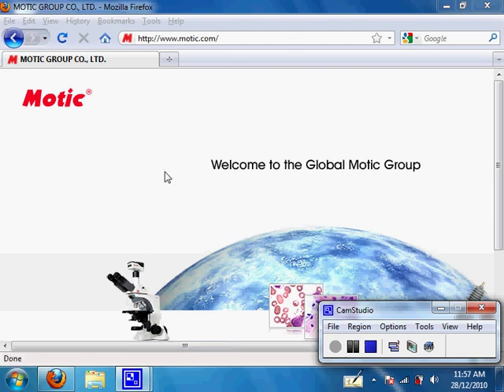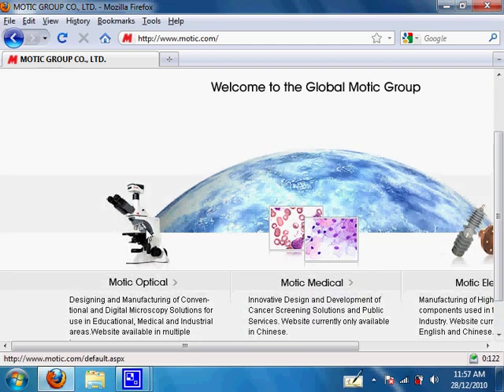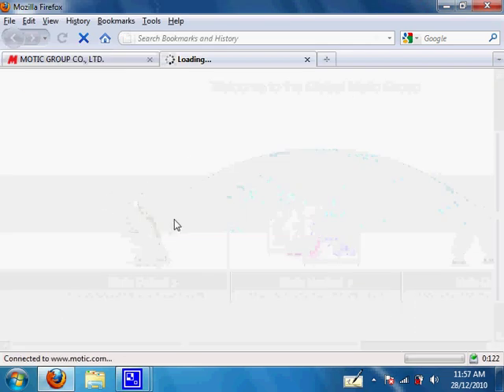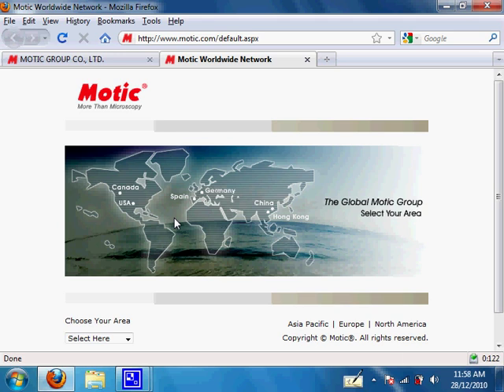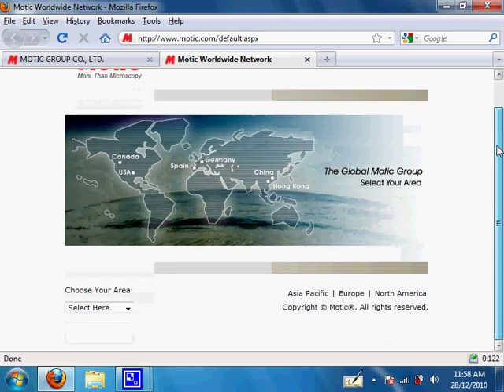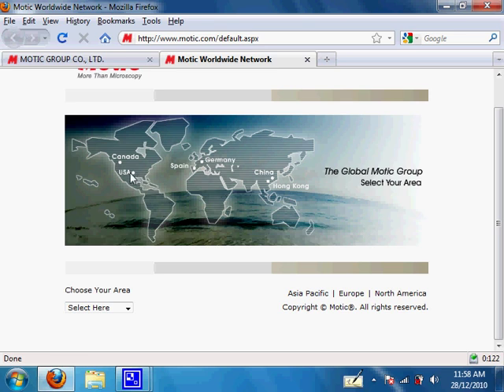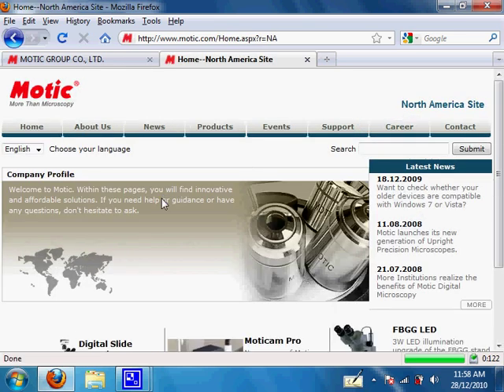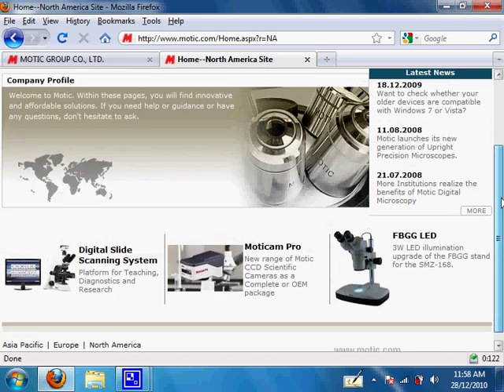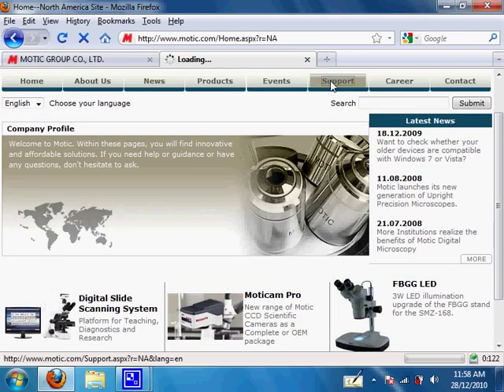Please first go onto your browser and type in this address: www.motic.com, and then go to Motic Optical. Even if you have the software CD, please follow along — the latest software will make it much easier to install the software and the driver.